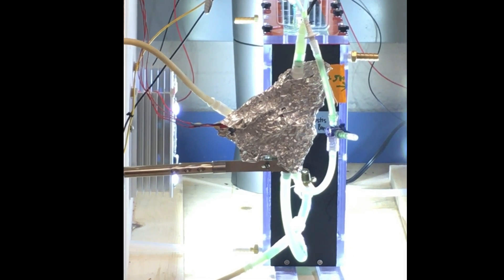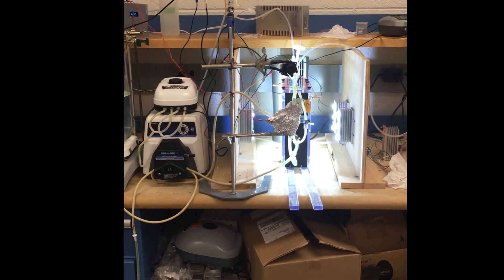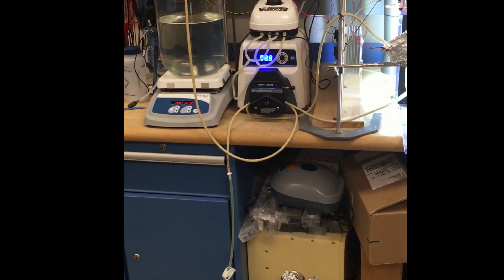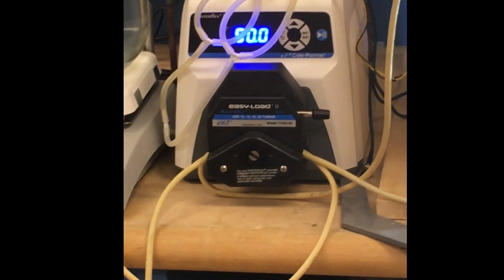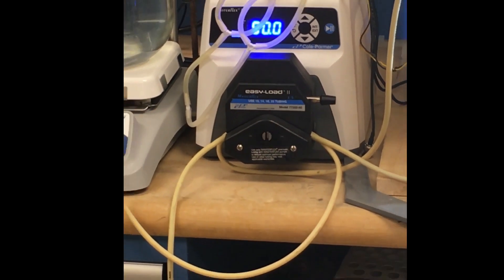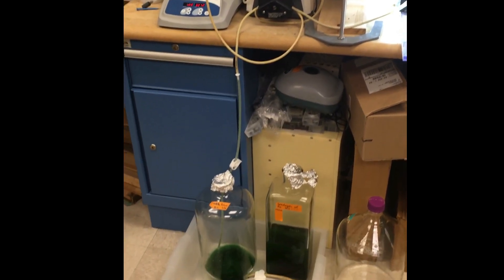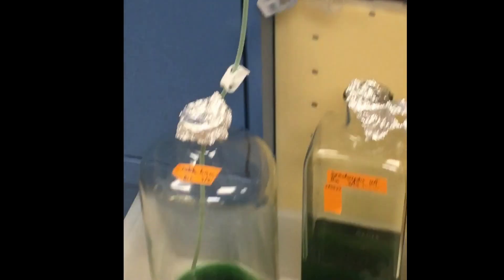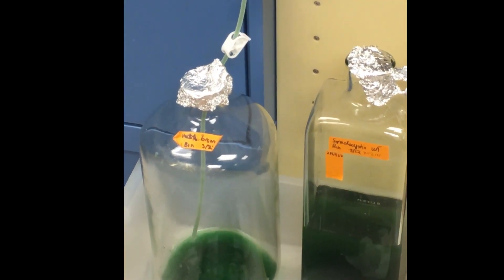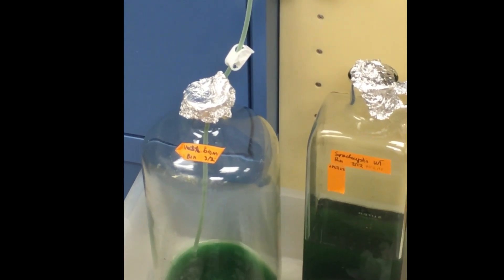In this setup, I have a turbidity sensor from a washing machine, in this case covered in aluminum foil, and the analog signal was transferred to an Arduino box. That Arduino box depends on the set value of a potentiometer and will turn on and off the pump to extract and add media to the reactor. And that is how the biomass density controls.